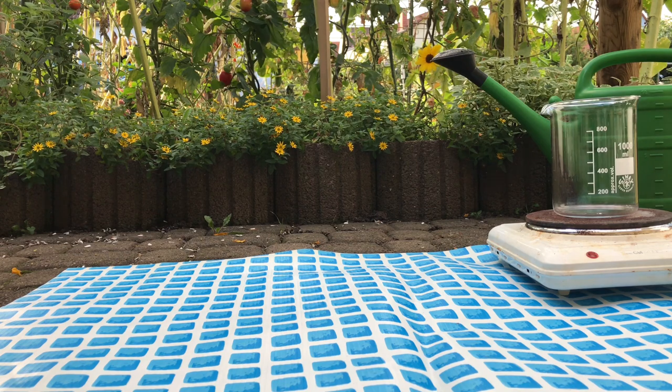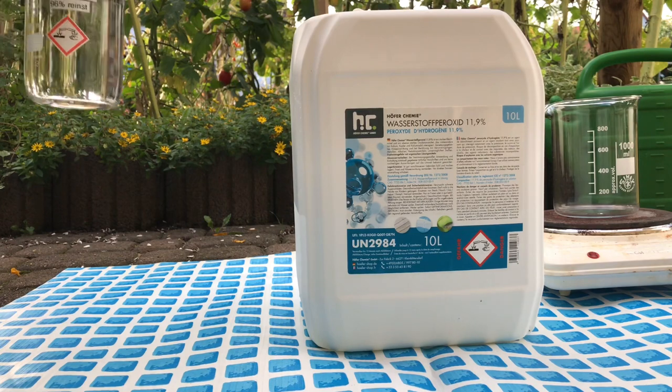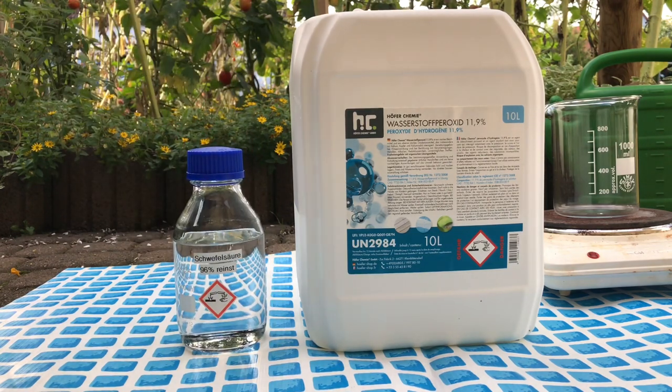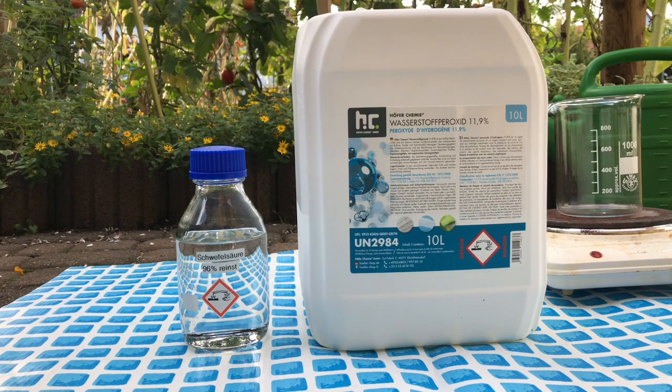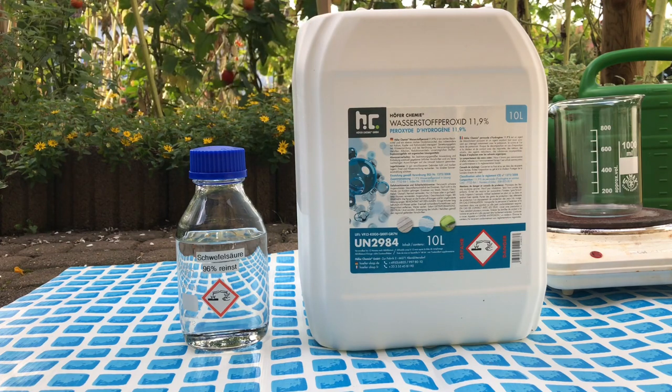Welcome back everyone. Today we are going to make some piranha solution. For this you will need some 11.9% hydrogen peroxide and 96% sulfuric acid. Although this cannot be stressed enough, this preparation — or rather this experiment — is really dangerous. Normally 30% hydrogen peroxide would be used, but we don't have that and it also works with 11.9% hydrogen peroxide. Do not try this at home.